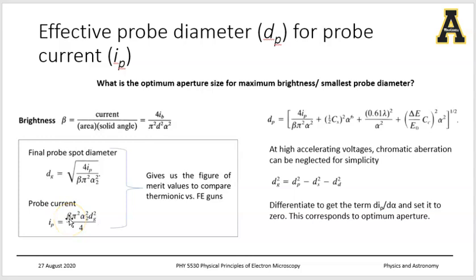That is quite expected. Now you take the dG and the aberration relationships that we saw in the last slide, you plug them in here, and you get the relationship that would describe the beam profile or the beam diameter, while you take into account all the different aberrations.